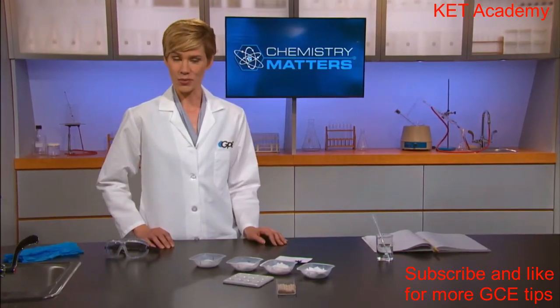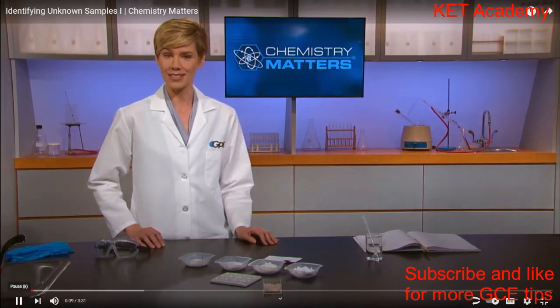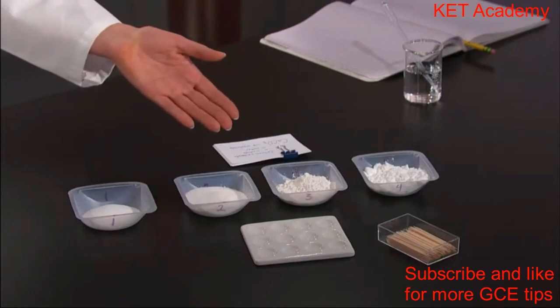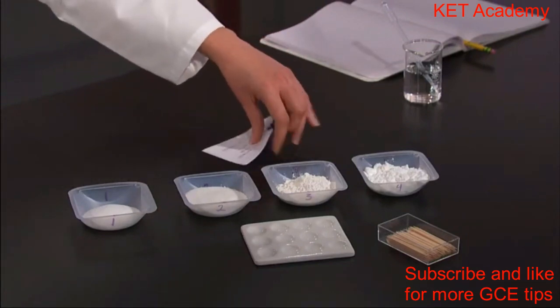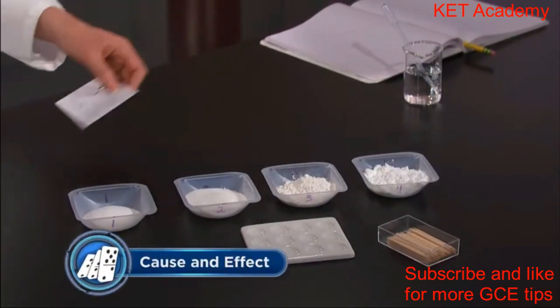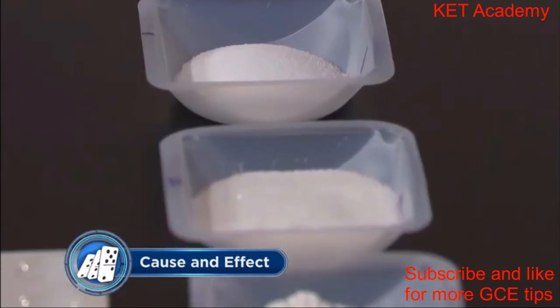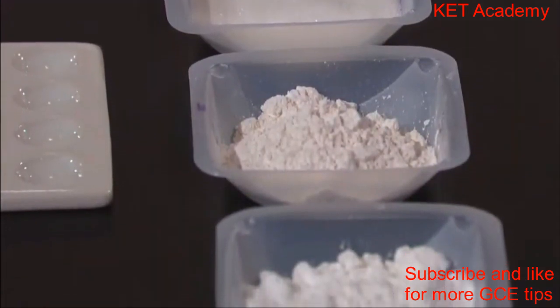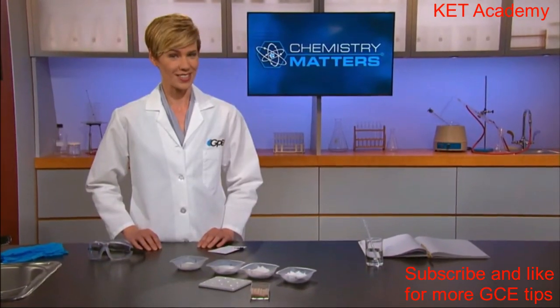So far in this unit, we've been studying chemical reactivity. And now we're going to use that information to identify these 4 white powder samples using several different laboratory tests. Now, these powders may all look the same, but they're all different chemicals. Let's see if our students can figure out how to tell them apart.